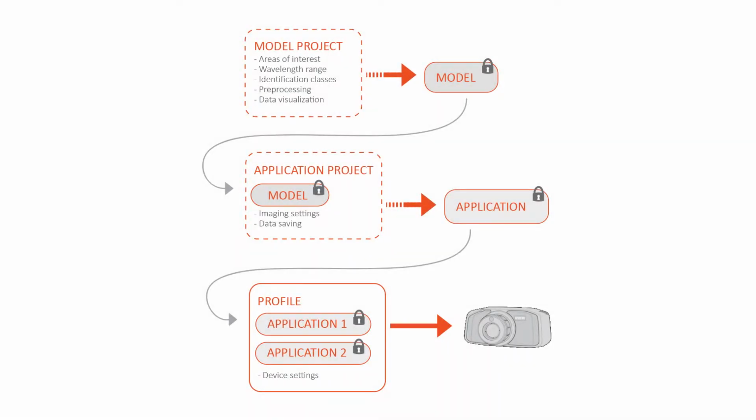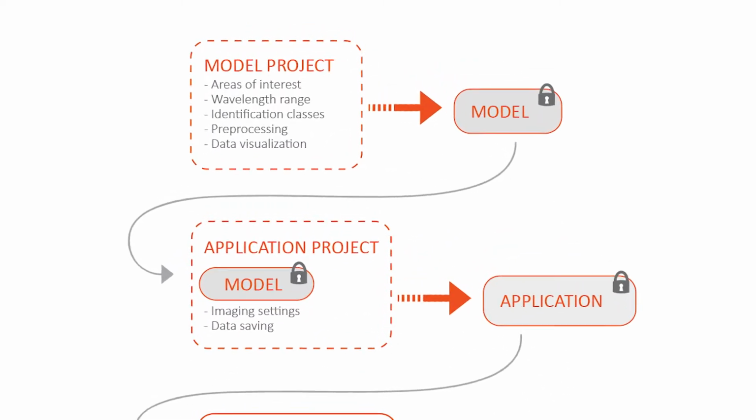A model is a non-editable executable which is exported from a model project. This can then be used in an application to define how the data is processed. Before starting the model creation, let's look at the relationship between applications, models, and projects.